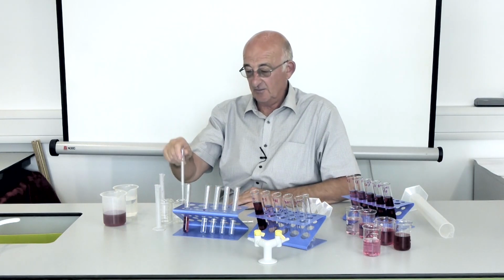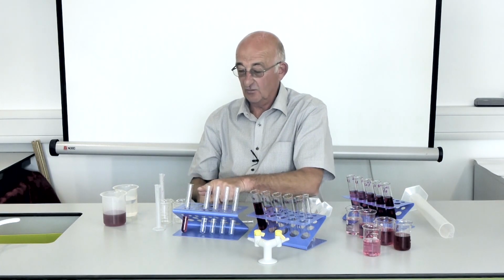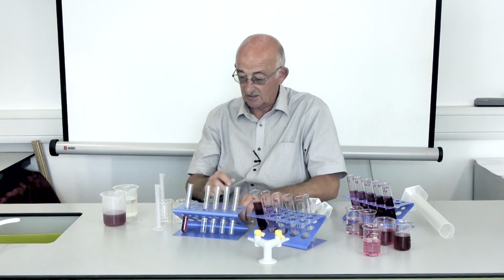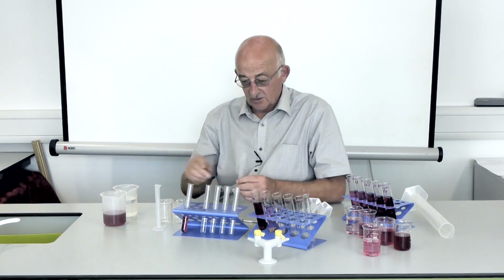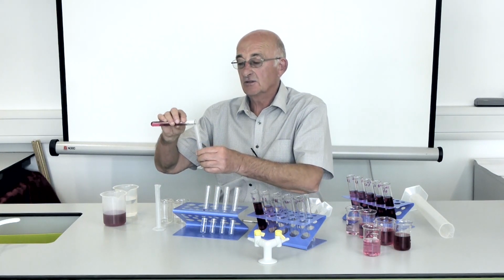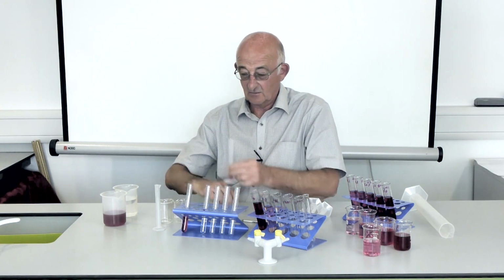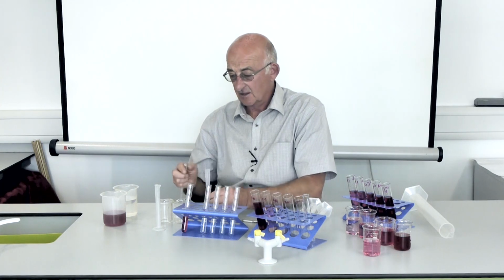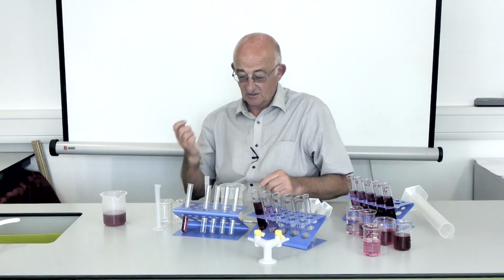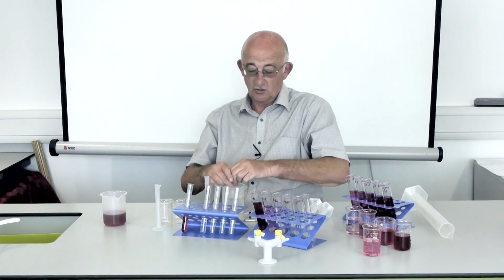So one way would be to put your pipette in, take out 1 mil, put it into the next tube, add 9 mil of water, give that a good mix up, and away we go along that particular process. Alternatively, you could pour 1 mil back into the measuring cylinder. I could adjust it very carefully with a pipette so I've got the right amount. Then add 9 mil of water, and I might use either a pipette or a syringe to do that, just use a syringe to do that.